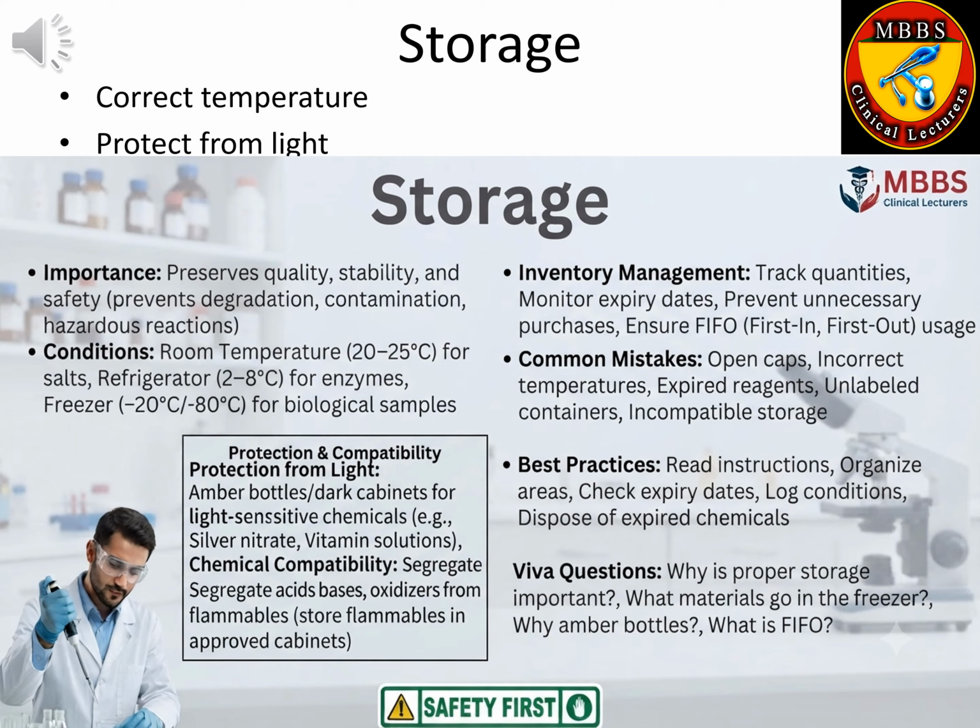Chemical compatibility. Never store incompatible chemicals together. For example, acids should be stored separately from bases. Oxidizing agents should be separated from flammable substances. Flammable chemicals should be kept in approved flammable storage cabinets.